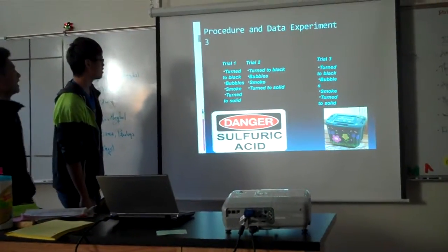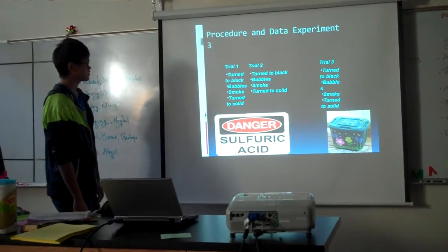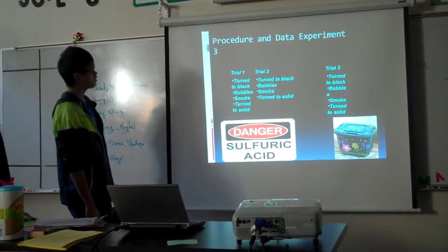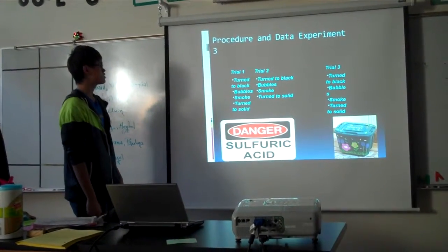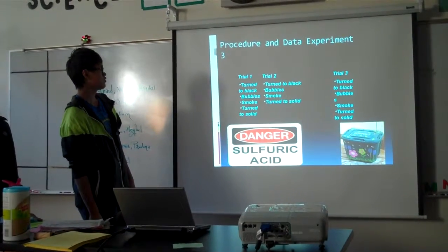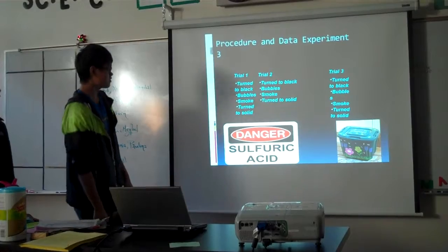Trial 1 turned black, with bubbles and smoke, and turned to solid. Trial 2 turned black, with bubbles and smoke, and turned to solid. Trial 3 turned black, with bubbles and smoke, and turned to solid.